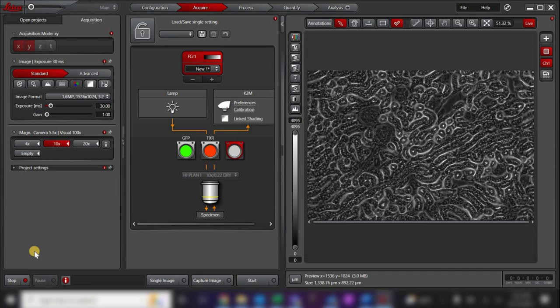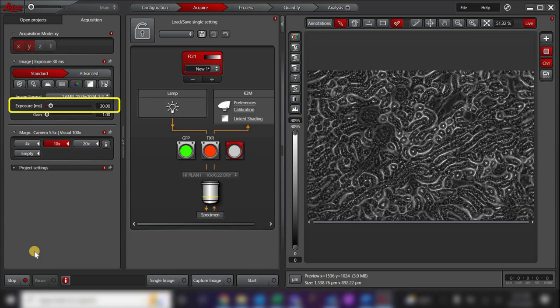Set an appropriate exposure time. Here, I've already set the exposure for my phase contrast image to 30 milliseconds. When you are happy with your image, press Start to take the image.